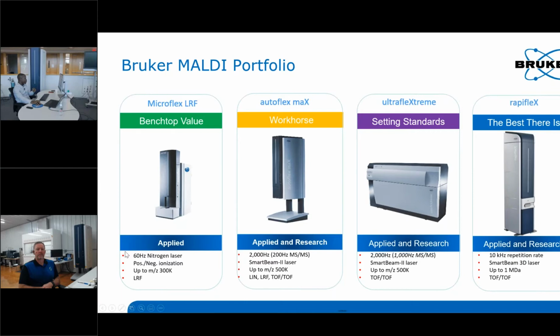It comes equipped with a 60 hertz nitrogen laser. It can be operated in both positive and negative ionization modes and has a mass range of up to 300 kilodalton, and can be operated in both linear and reflectron mode as well.